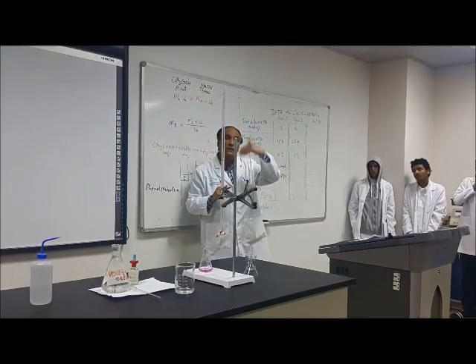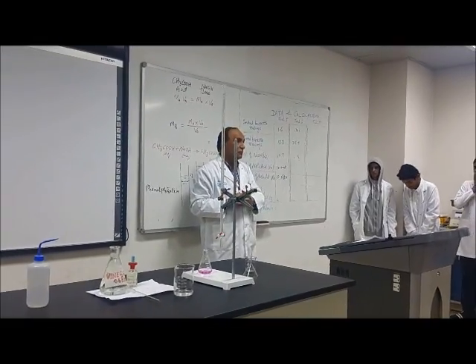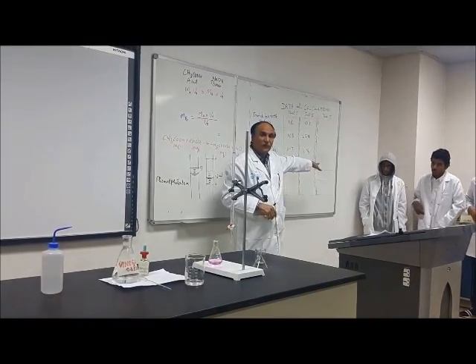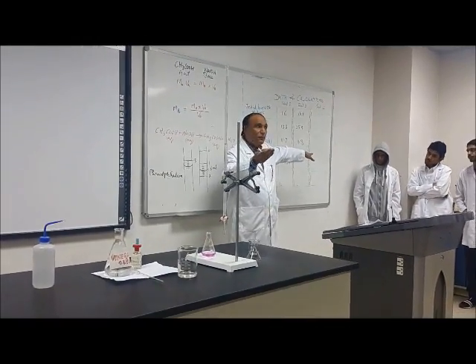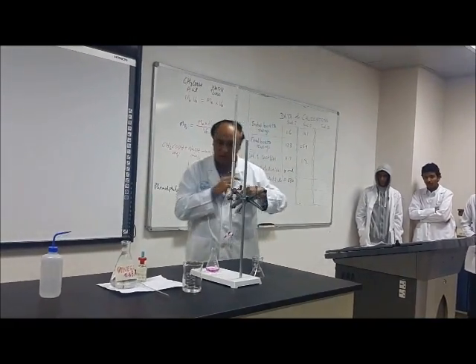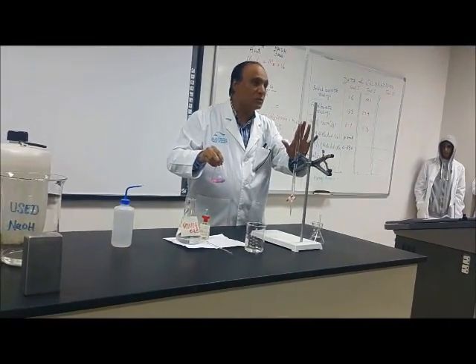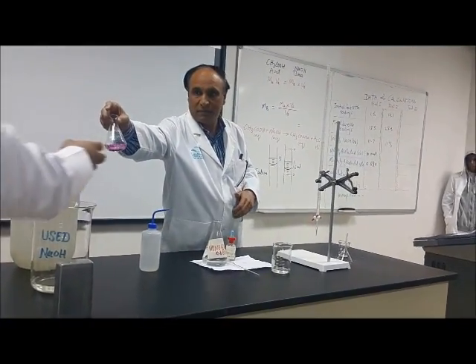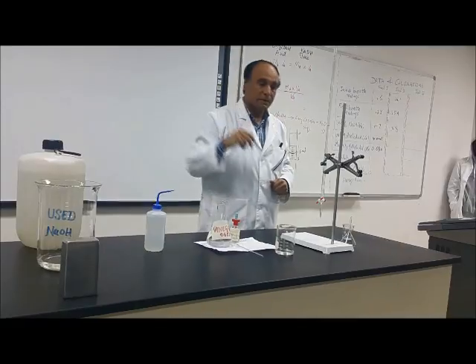And if it is more than 0.3, what to do? Again. Do it again. No problem. You have plenty of time. If it is more than 0.3, do it again. I will show you how we will start with the calculation. I will not do the third time. Did you understand? Yes. Please watch this one.